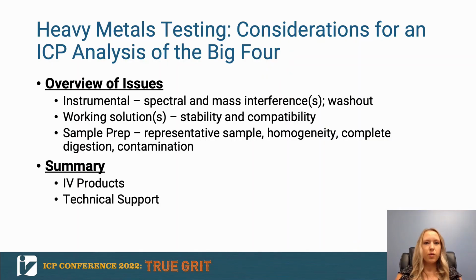We're going to start off by going through some of the instrumental issues that you may encounter in your analysis. Then we're going to talk about your working solutions and how you can plan for maximum stability and compatibility of those. Then we're going to go through some sample prep techniques and strategies to help you make sure that you're not having any loss of analytes or any other issues. And finally, we're going to go through some of the products that IV has to offer that may help in your analysis, as well as our technical support resources.